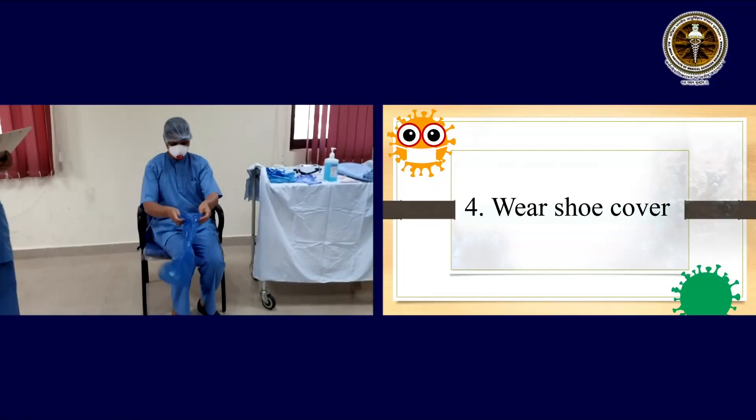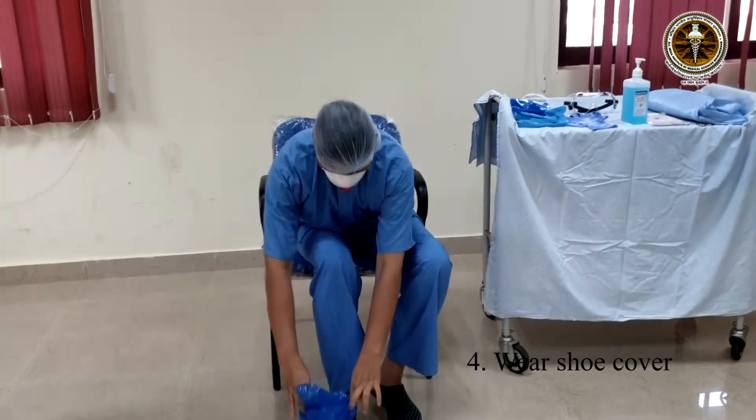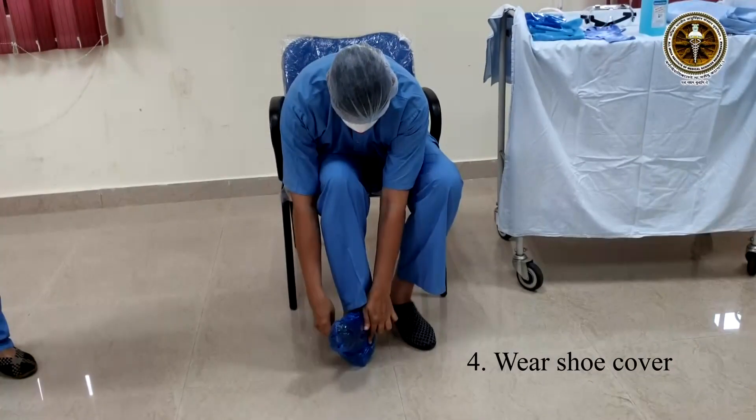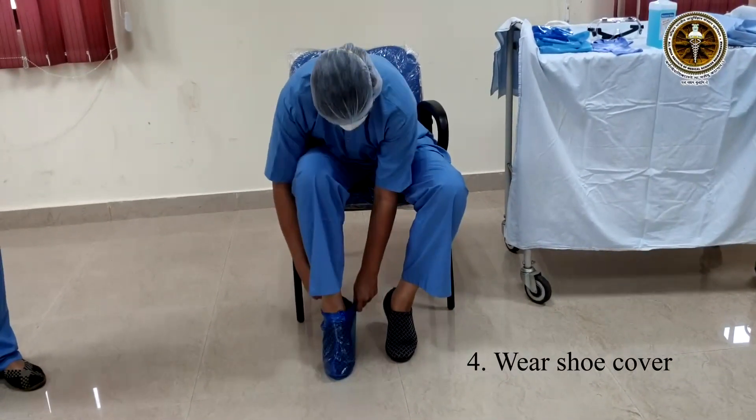Next is wearing the shoe cover. Sit comfortably on a chair. Take the leggings and wear them. The leggings should reach at least till mid-calf.